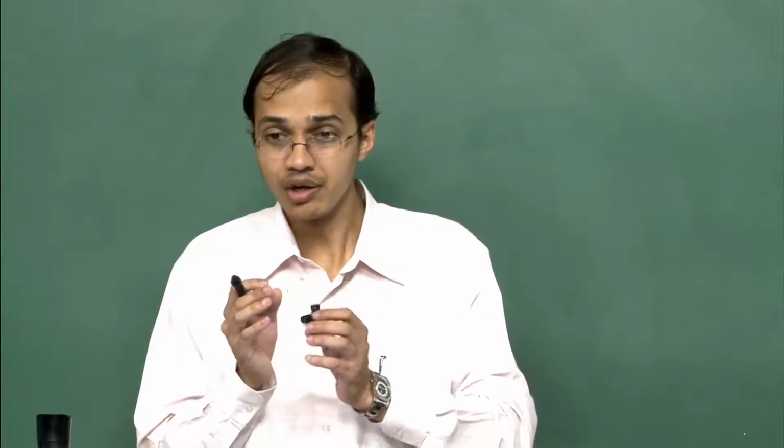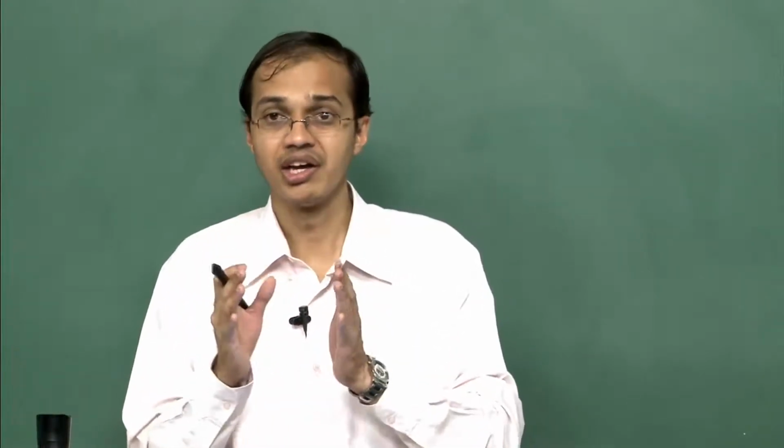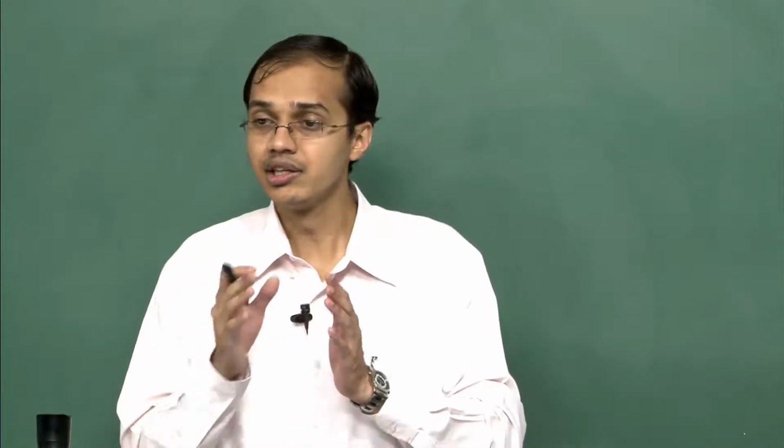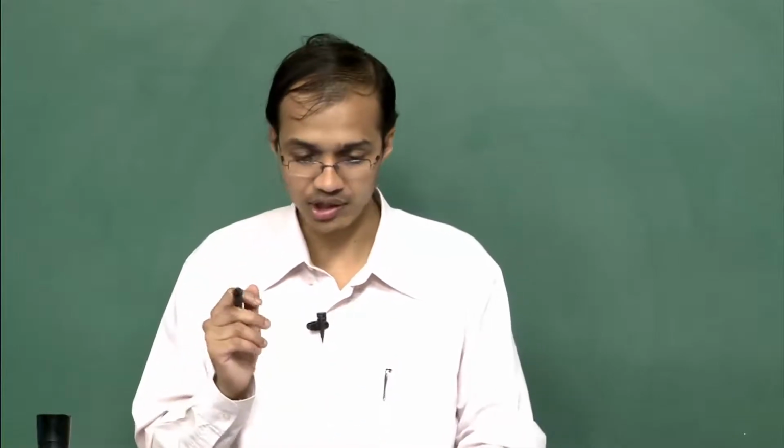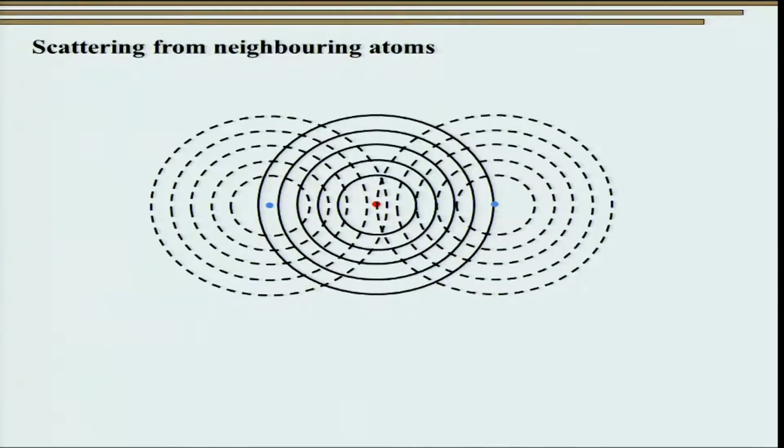However, this is happening very locally and at the atomic level, and these modulations are essentially seen in the XANES or for that matter EXAFS spectra, and this essentially contributes to all the oscillations that we are seeing over here. We will have a better figure later in the class, but the situation is very similar to what has been shown in the figure.